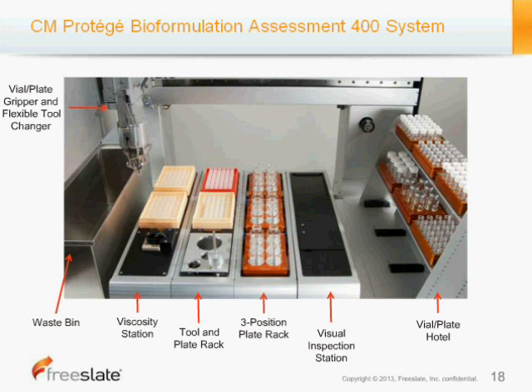Since the system is designed to operate unattended, we wanted to add the capacity so people could load up the system with many plates. And so on the far right-hand side, you see a vial plate hotel.